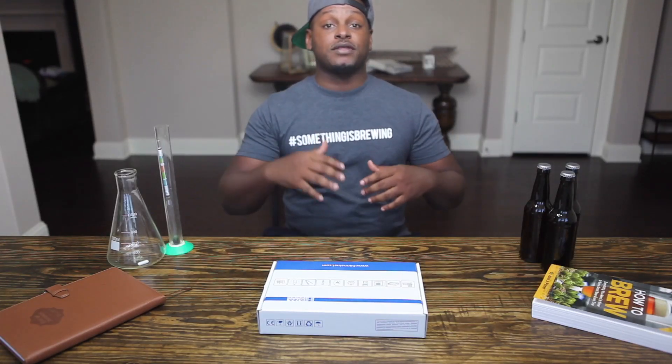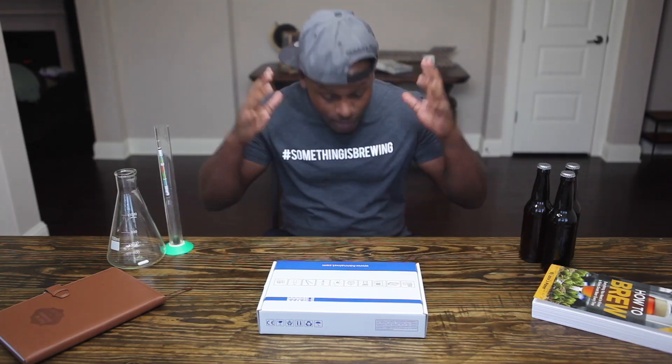Hey, what's going on BrewTube? It's your host Shannon Harris, aka The Brew Brother, and thank you for tuning in to another unboxing video. Today we got Hanna Instruments and I'm going to be presenting and unboxing their brand new Beer Halo Bluetooth pH Meter.